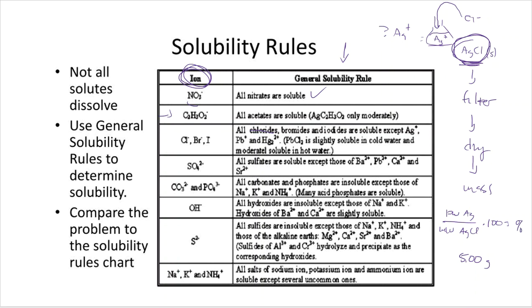Okay, so let's say that this is 50%. It's not, but let's say that it is. We'll keep the calculation simple. That means that 50% of the mass is silver. Again, that's a phony number. So that means half of this weight will actually be contributed by silver. So what's half of 5? It's 2.5. So 2.5 grams would be for silver, and 2.5 grams would be for chloride.